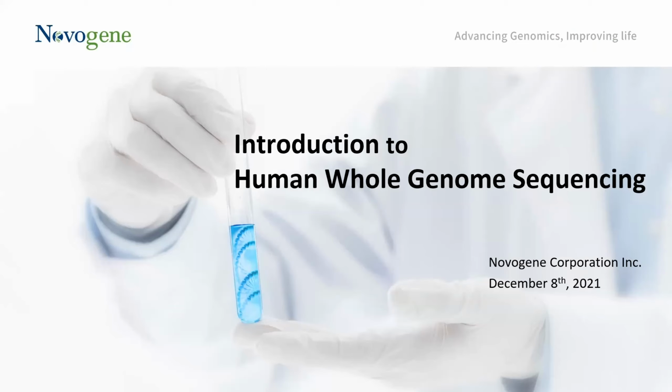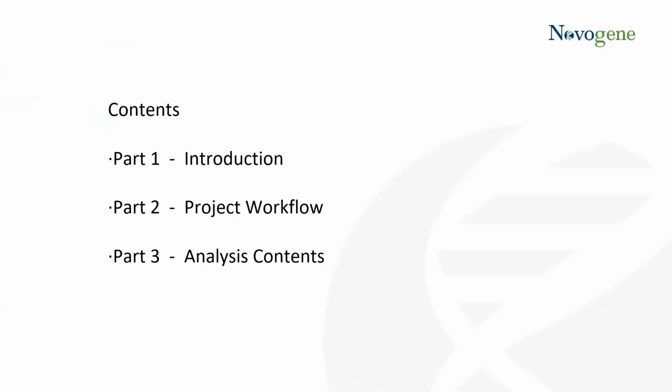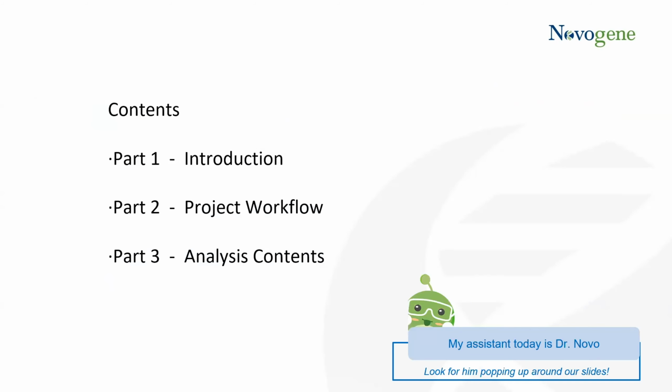I will be talking to you guys a little bit about human whole genome sequencing. This presentation will be divided in three parts. First, I will go over a quick introduction, followed by our project workflow, then the possible content in our bioinformatic analysis, and my assistant will be Dr. Novo, so look for him throughout the presentation.